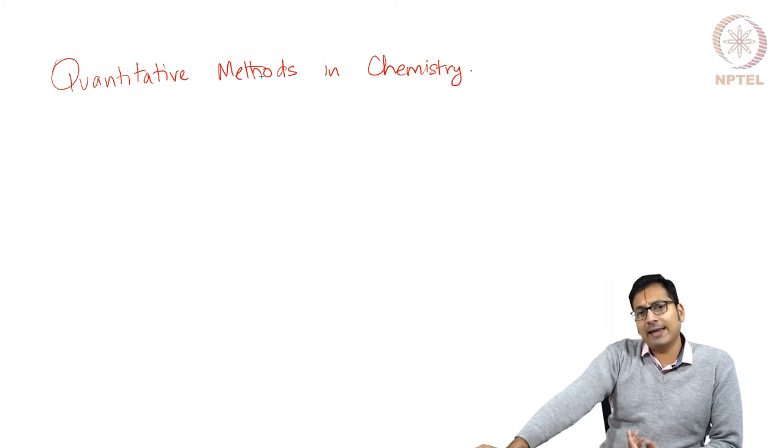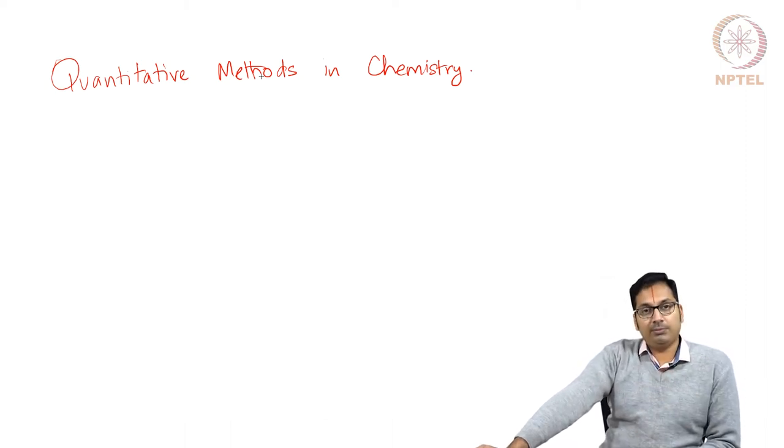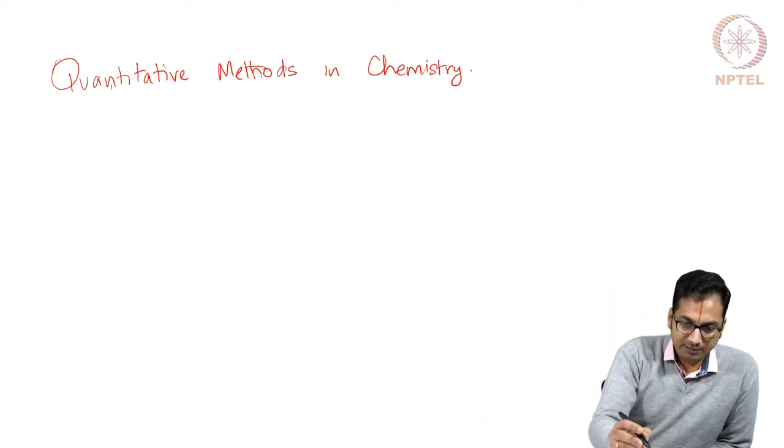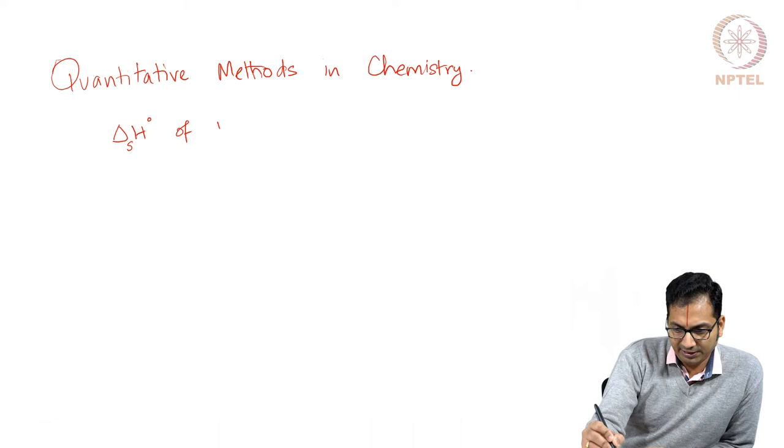In today's class, we will be extending a similar idea to use the spreadsheet software to see how data analysis can be done, more of a problem, let's say. So the problem that we'll be defining here would be to determine the heat of solution of benzoic acid.